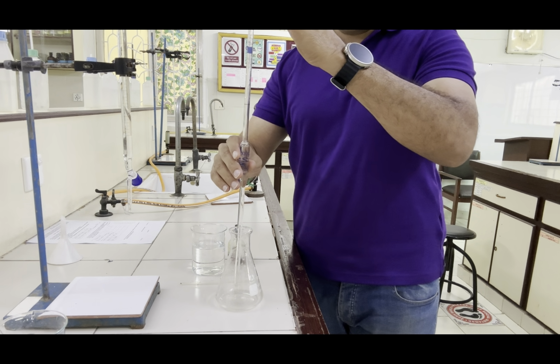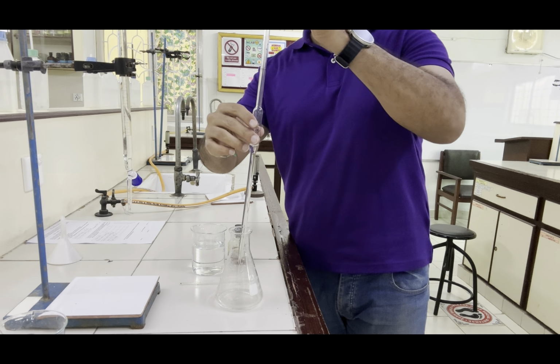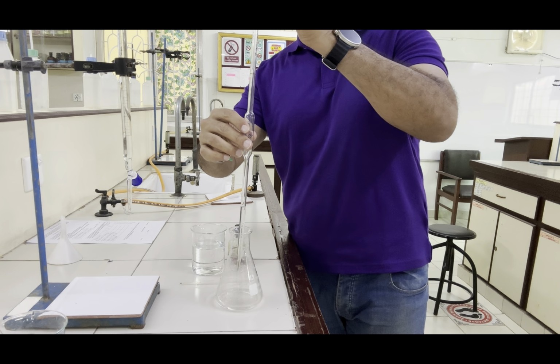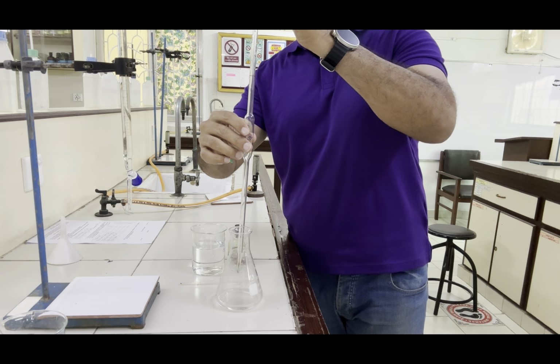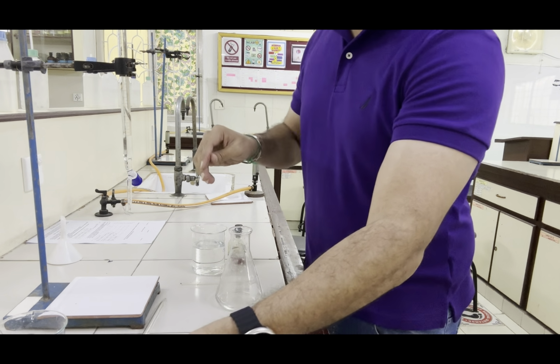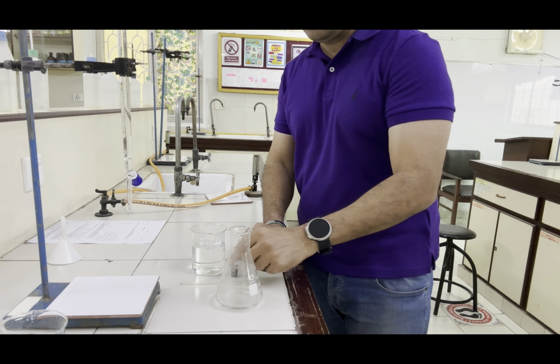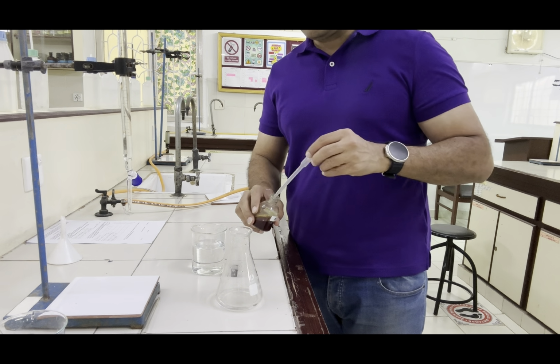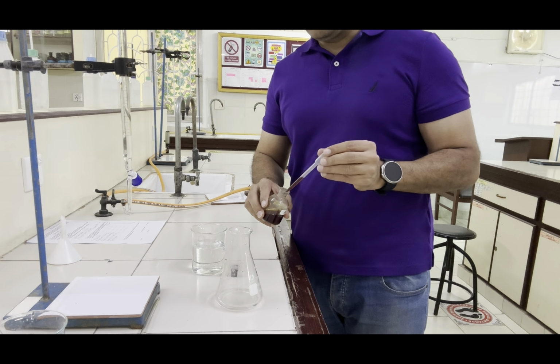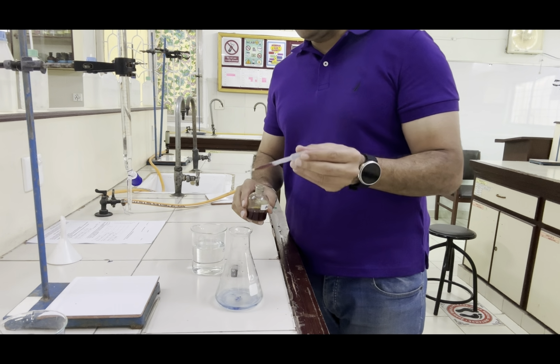E for eject, and as soon as the solution is empty, we will again add few drops of indicator. We have learned that 3 drops must be added. So 1, 2, 3 drops again.